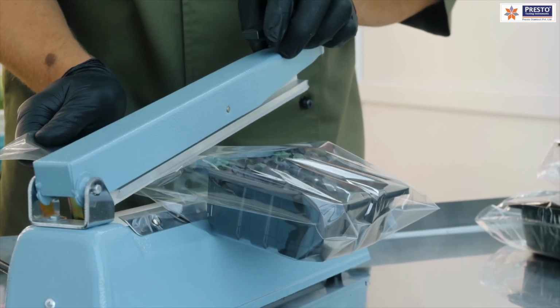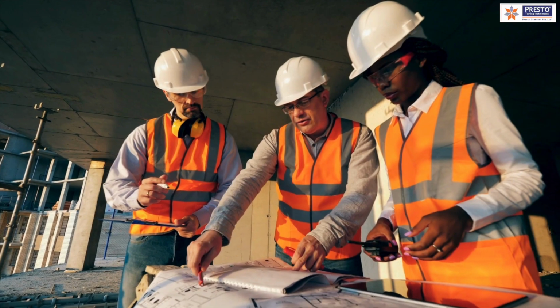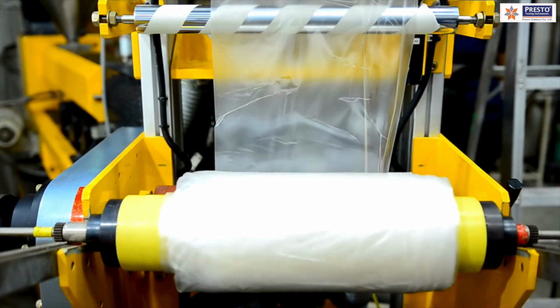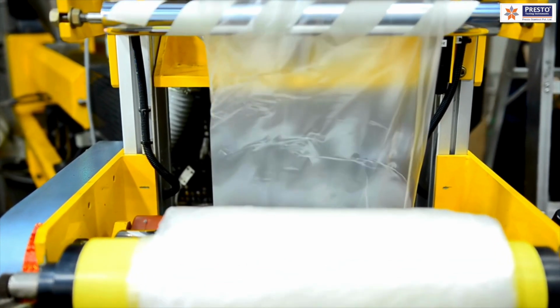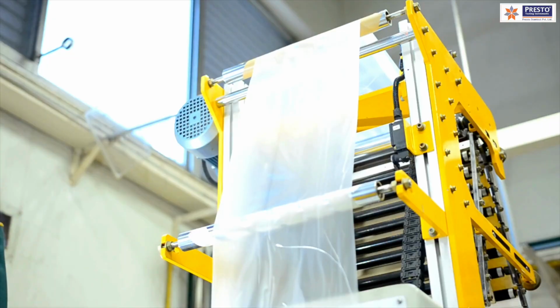So the goal of this video is to educate packaging professionals, lab technicians, QC managers and procurement team on ASTM D882, why it matters, how to conduct the test and how to interpret the results. So plastic films look simple, but testing their strength is anything but. ASTM D882 is the global standard for measuring tensile properties of thin plastic sheeting, but are you doing it right?